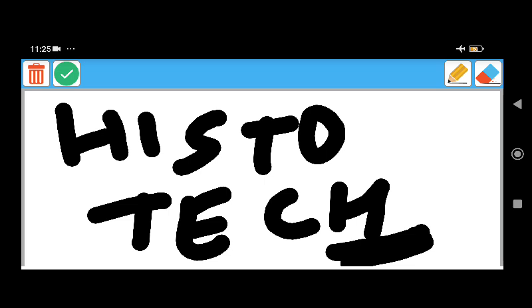Formaldehyde reacts with proteins and groups to cross-link molecules to give rise to an insoluble end product. It penetrates the tissue but it is relatively slow.